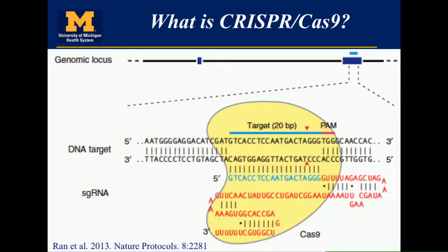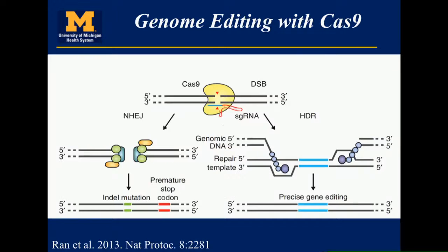So Prem gave you the introduction to CRISPR Cas9, so I'm not going to spend time on that. The main thing we're using Cas9 for, what we want it to do, is to produce a double-strand break on the chromosome. And once we have a double-strand break, whether it's induced by CRISPR, zinc fingers, TALENs, or meganucleases, the chromosome in the zygote has to undergo either non-homologous end-joining repair, in which case an indel of a few base pairs to a few hundred base pairs can be formed.